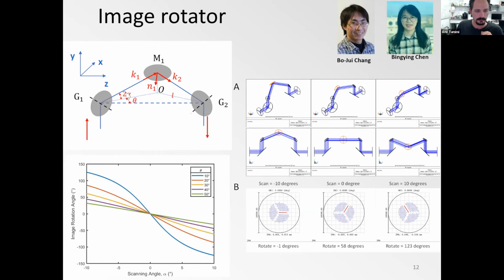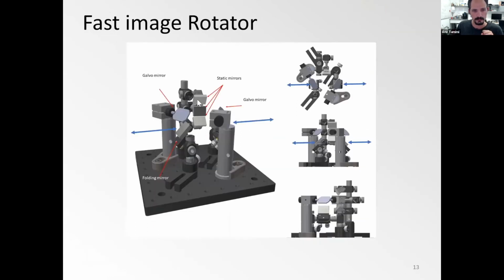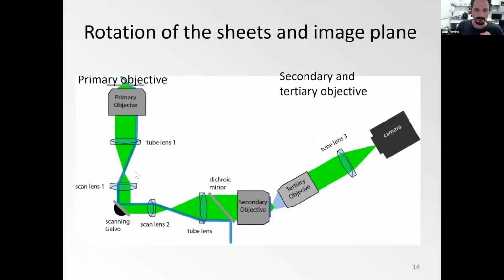Yes, if you make this too small, you would need a larger distance to separate these 3 mirrors. So 10 degree also works out so that these fit. Sure, you could have less and just make the whole thing bigger, but that would counter our demand that it fits in that space here. Great, thank you. Sure.